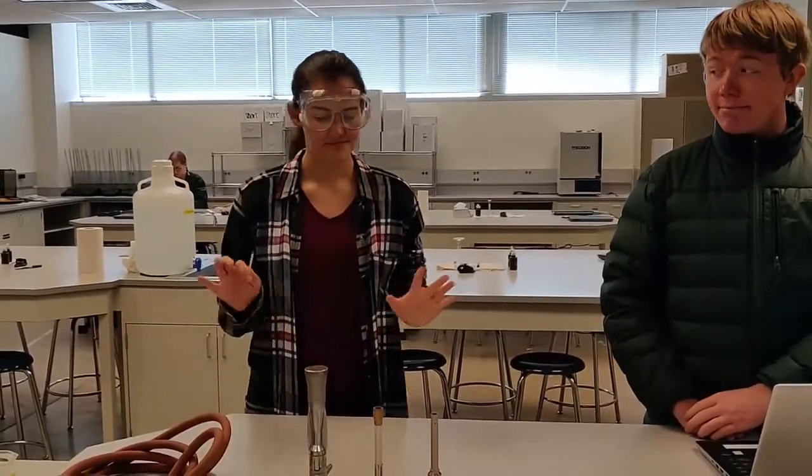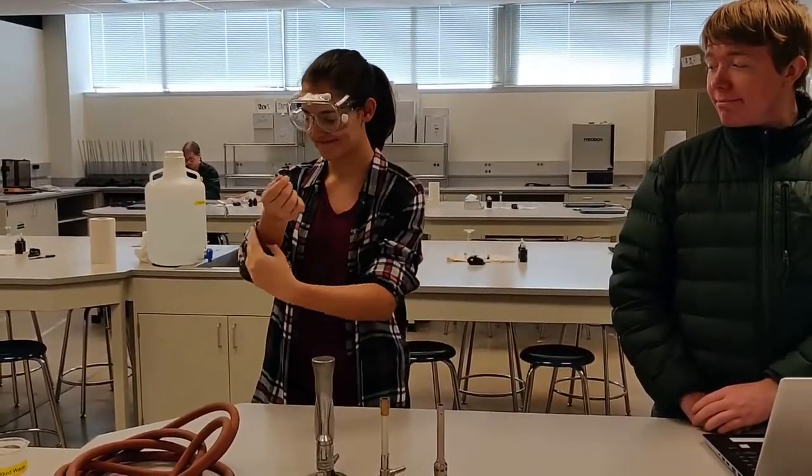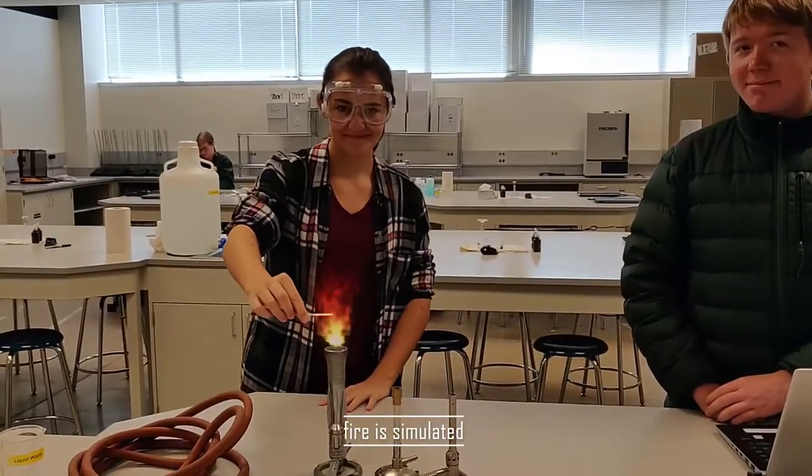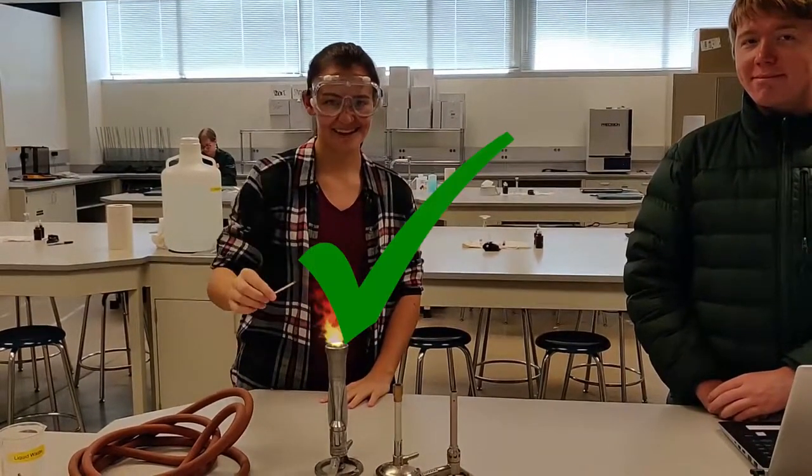Here is a proper example of fire safety behavior on a Bunsen burner, and here is an example of how you should not be lighting your Bunsen burner.